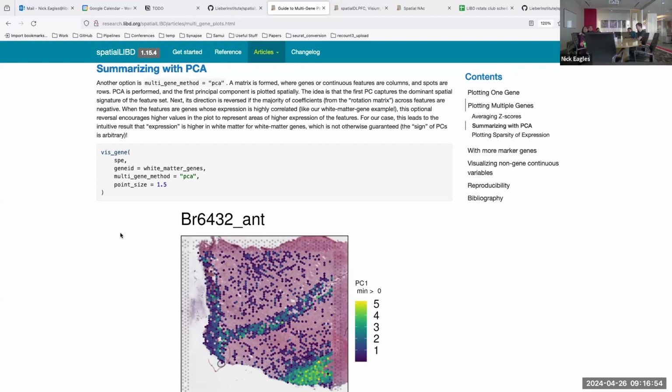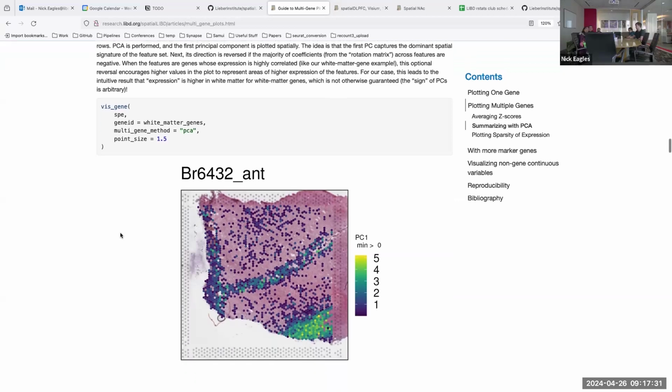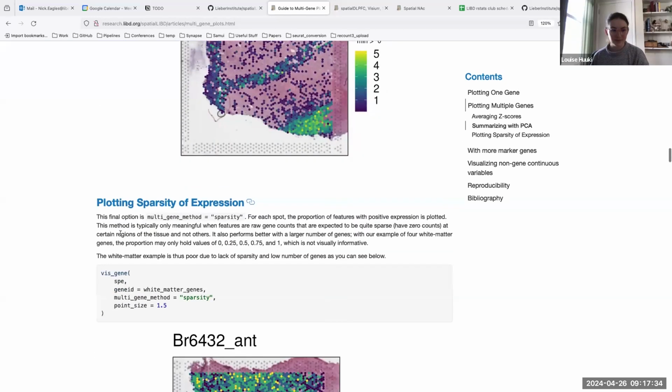No, not currently. I'd have to think about how that would work, but I guess that's a good idea, because it would be spot level data as well, right? Yeah, that could be neat. I get that it's different from what you're trying to do here, but it got me thinking. No, that's a good idea, actually. We might be able to incorporate that, because it is one data point per spot. That's cool. All right, cool. Thanks, Nick. No problem.